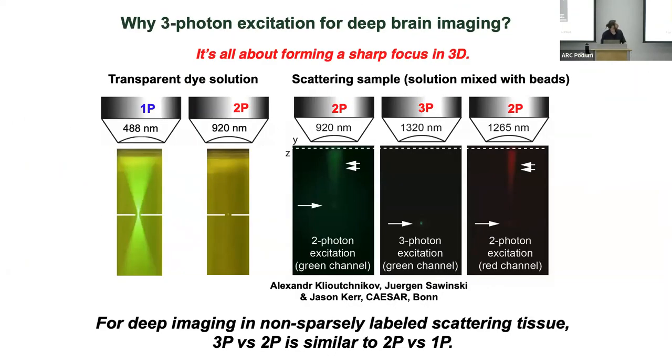So you can see that example here somewhat, and it's not rigorous in this case, but imagine, here we don't need a lot of laser intensity to generate that focus because there's no scattering. But if we had a highly scattering medium here, and this line was, say, 7 scattering lengths below the tissue, then we would go through dramatic exponential decay by the time we got here.